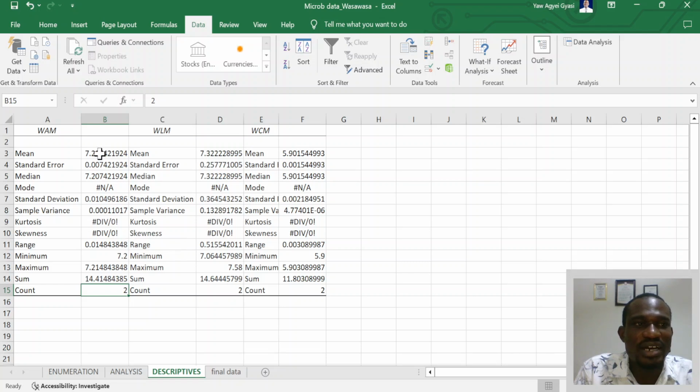So we can report our results as the mean plus or minus our standard deviation. This gives us an idea of how the data we've gathered looks like. And from here we have variances, so we can analyze these variances as our ANOVA in the ANOVA table. So let's look at the ANOVA now.